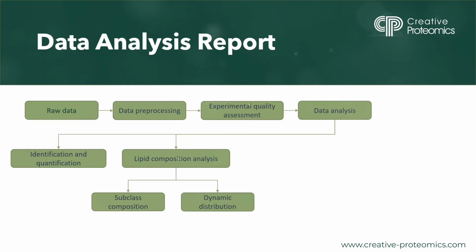We also investigate the dynamic distribution of lipids. By studying changes in the relative abundance of specific lipids across different conditions or time points, we gain insights into lipid metabolism, cellular responses, and disease-related alterations.